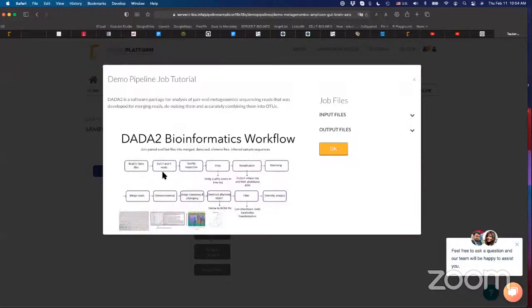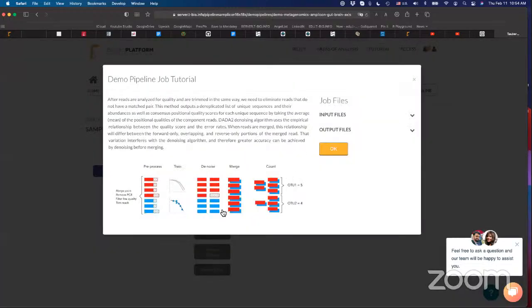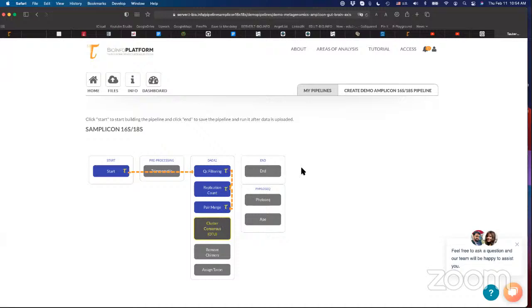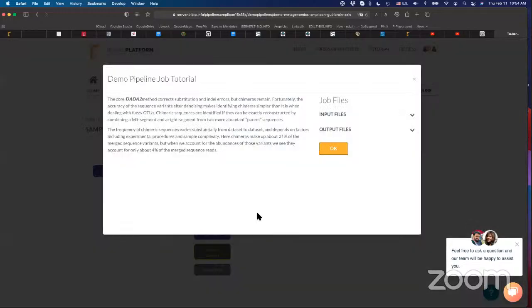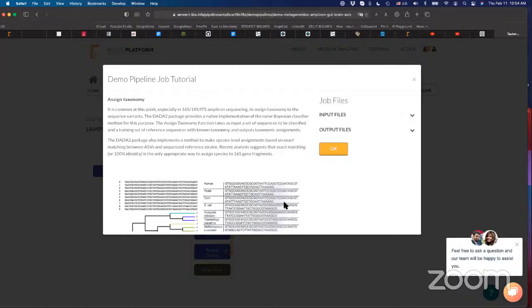Then the data pipeline consists of a number of different steps that are specifically designed to eliminate the noise in the data and make sure that the output is cleared of all contamination, because you're talking about many different unannotated reads from a whole variety of different microbes.